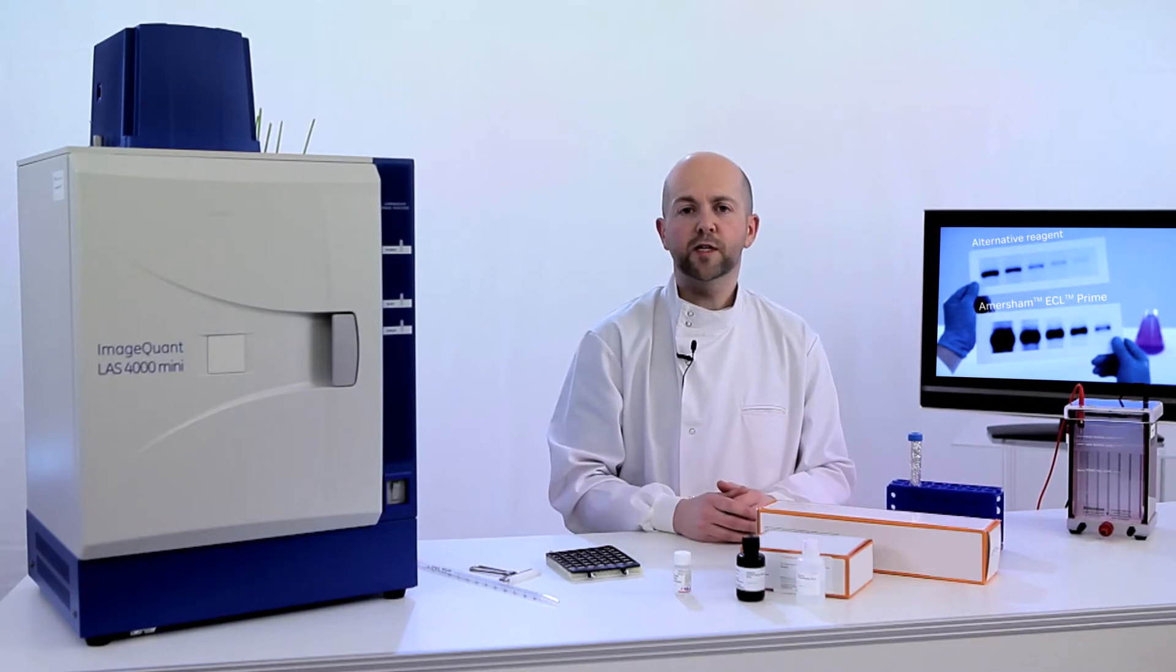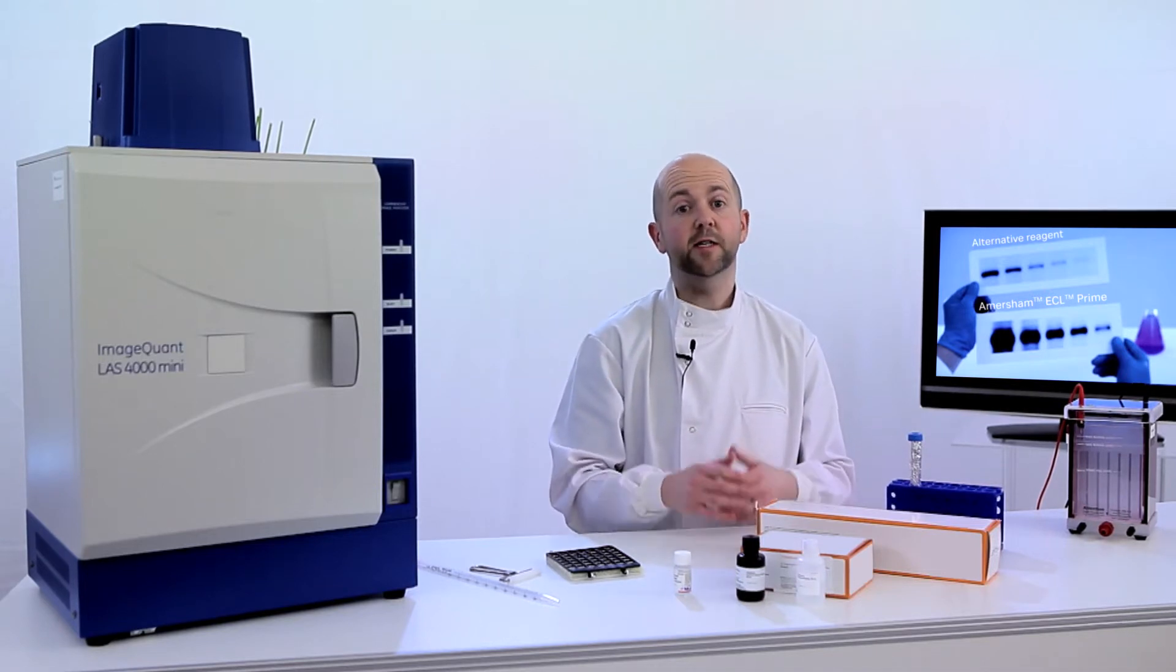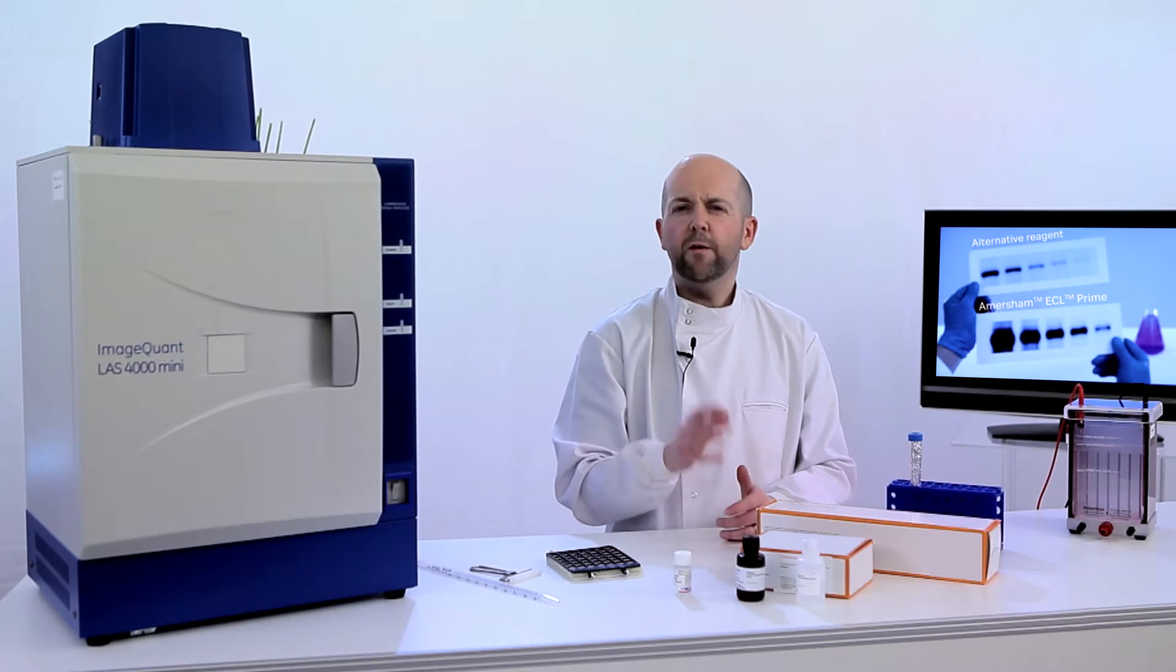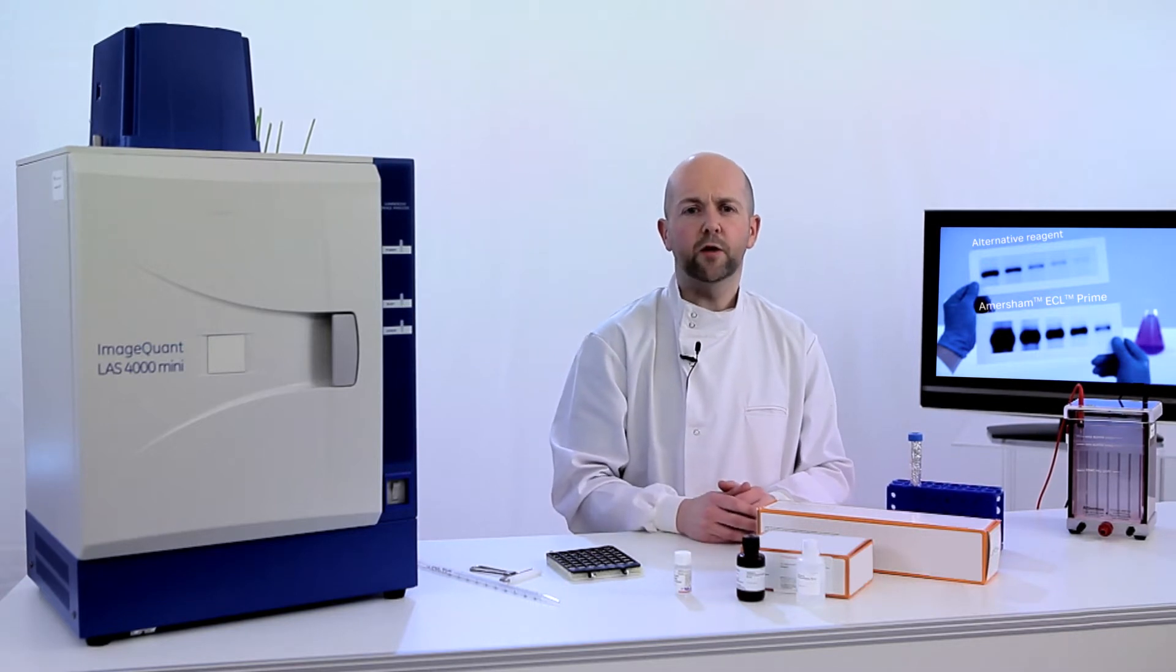It works with almost all standard protocols for chemiluminescent reagents. We find it better than all the other product options we have tried. After completing the electrophoresis of your sample, simply continue to use your own standard Western blotting protocol.